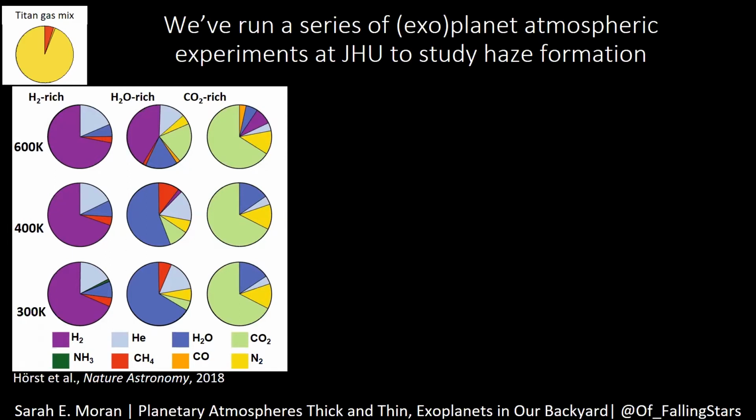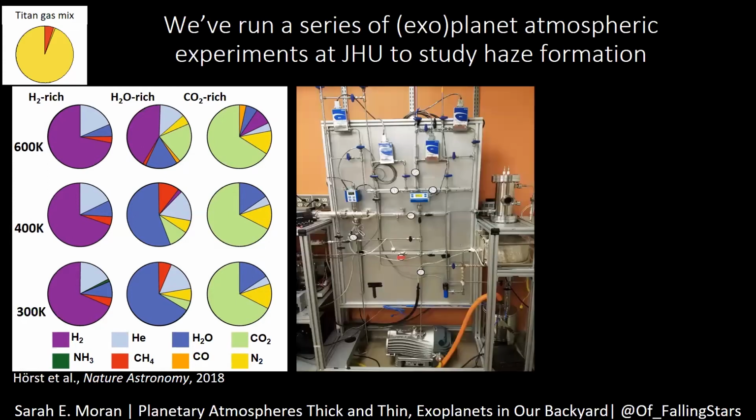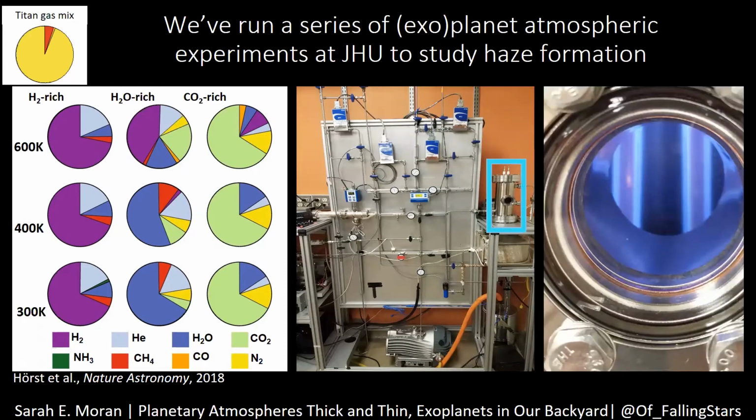And then up in the corner there, I also have our standard Titan gas mixture, which will become important in a second. This is what our laboratory setup looks like. So we flow all these different gas mixtures into this chamber here that I've highlighted for you, which looks like that when it's on. And we expose those gases to either a UV lamp or to a plasma discharge that initiates basically those chemical reactions to start breaking up those gas molecules and letting them reform into solid particles.